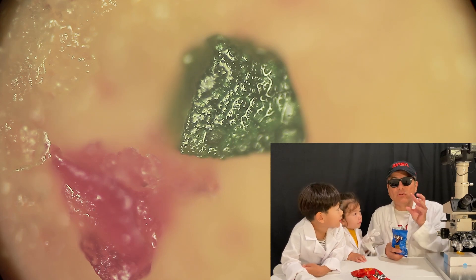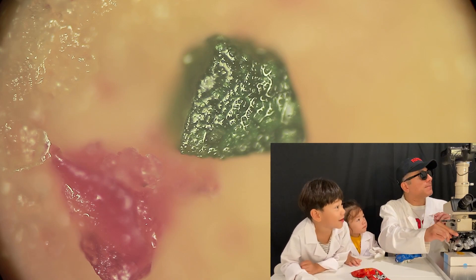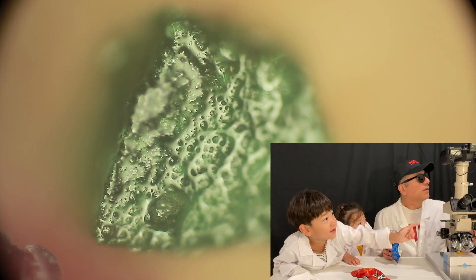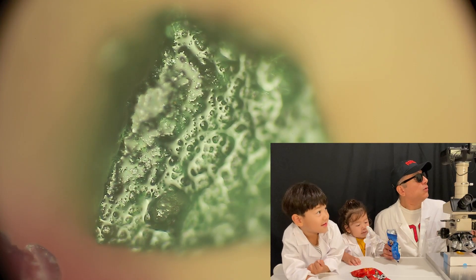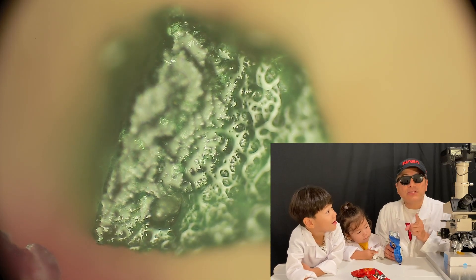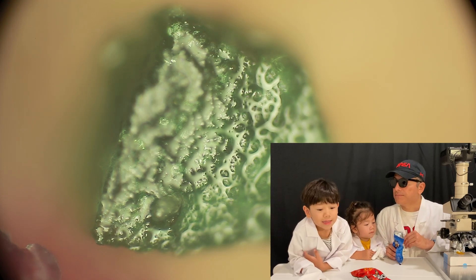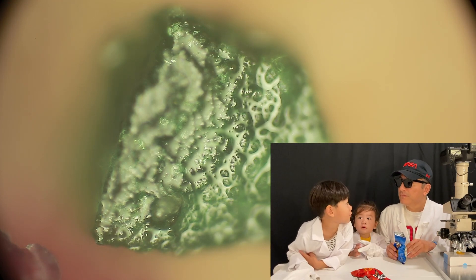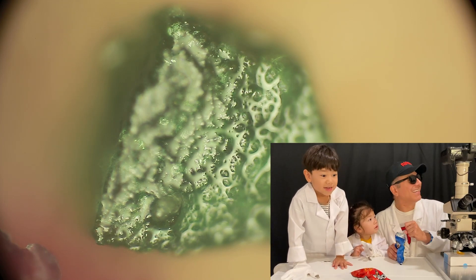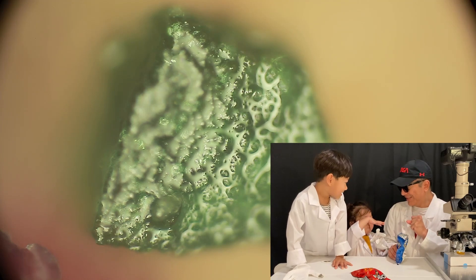Let's go to 20x and really explore what this guy looks like. 20x is next. Here we go. That thing is even bigger. And you know what it reminds me of? Can you think of something else we saw that it looks like? It looks like a gemstone. Doesn't it kind of look like the hematite — the green ones? That's what I was thinking. It does look like the hematite. So there it is — this is now 20x.